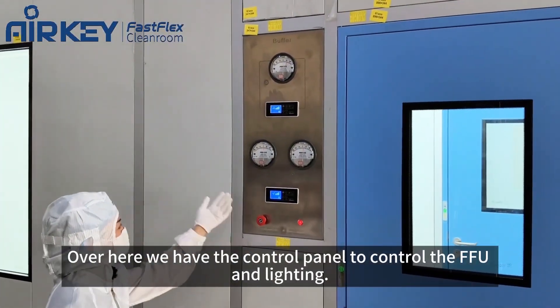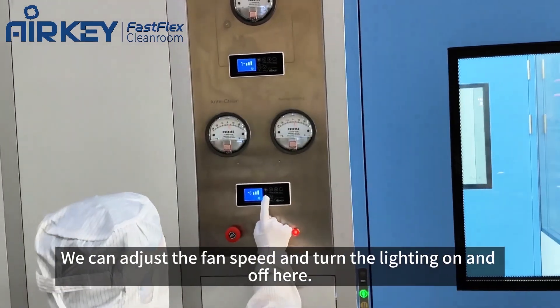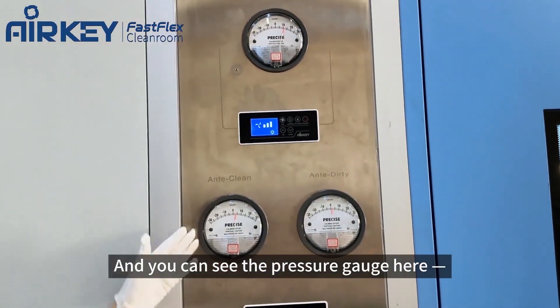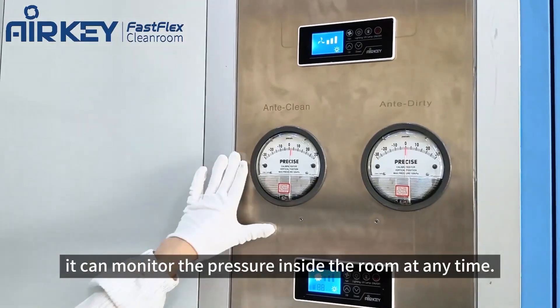Over here we have the control panel to control the FFU and lighting. We can adjust the fan speed and the lighting. You can also see the pressure gauge here — you can monitor the pressure inside the room anytime.